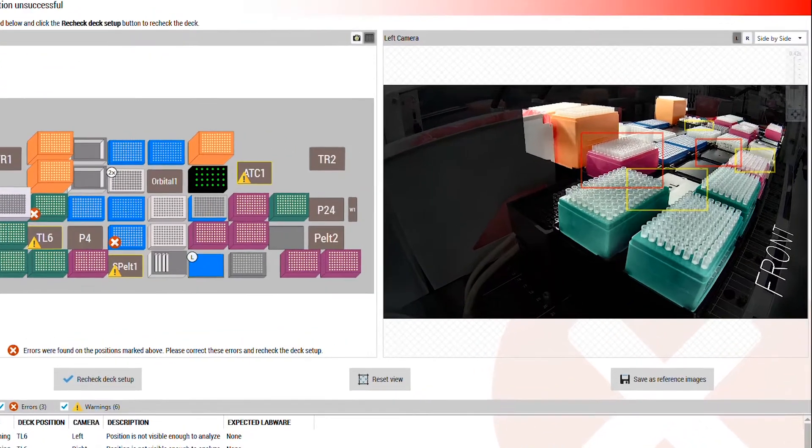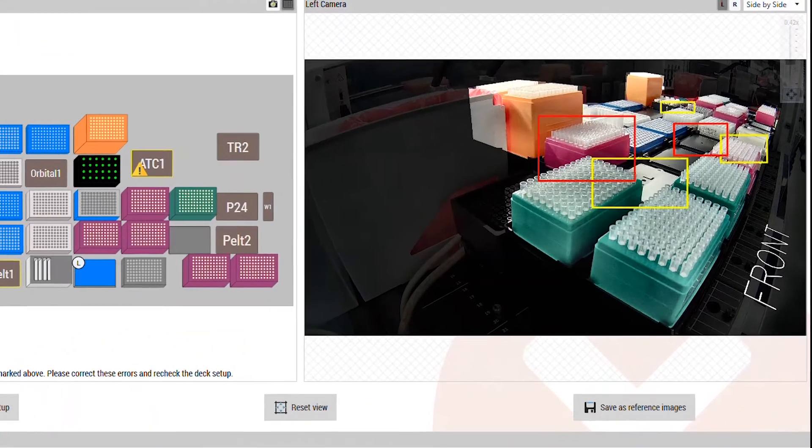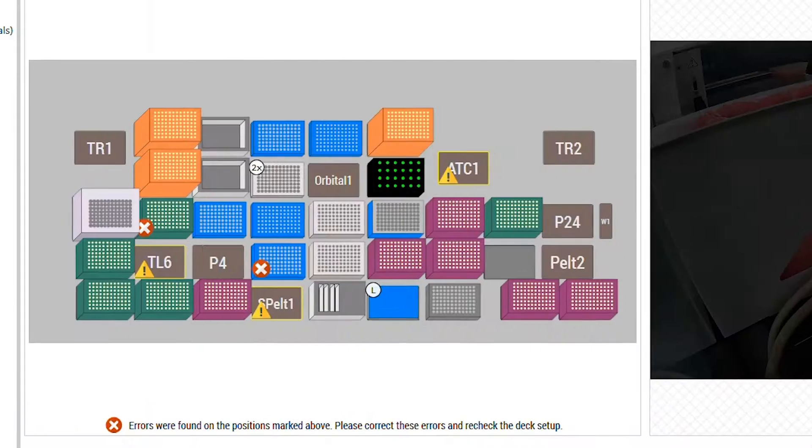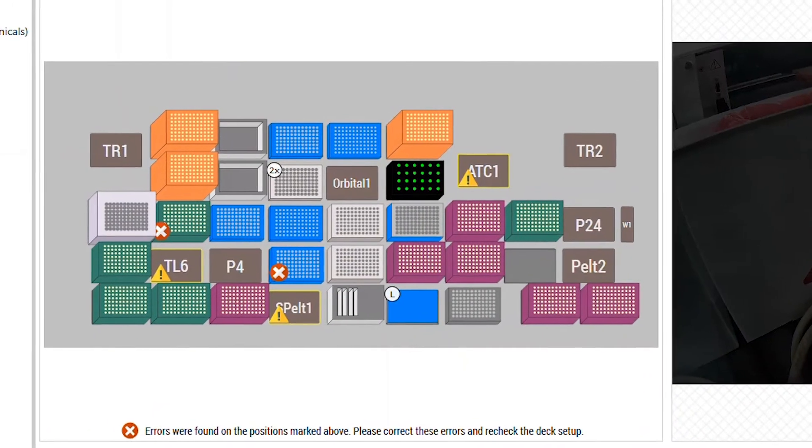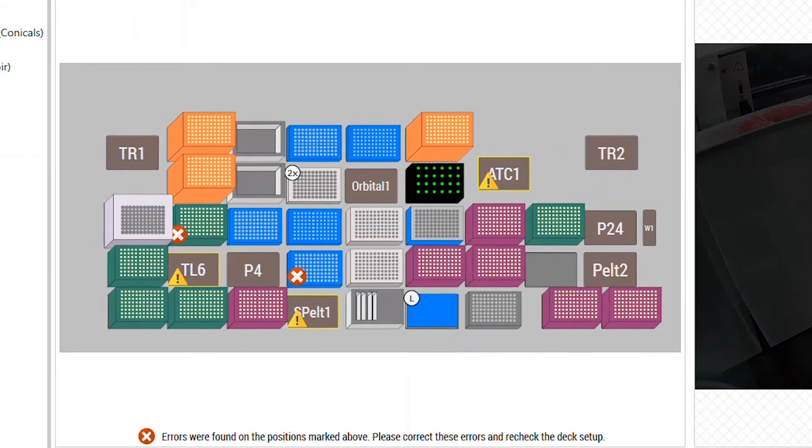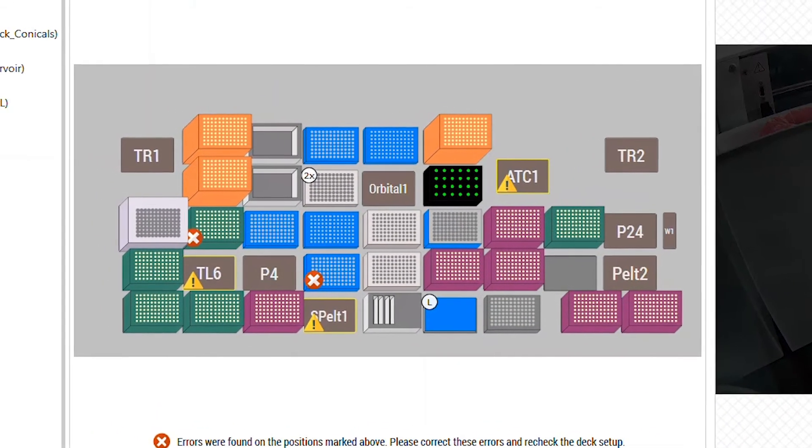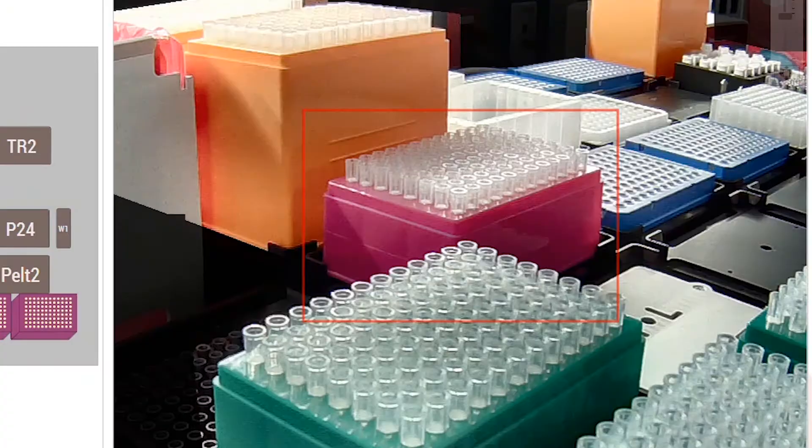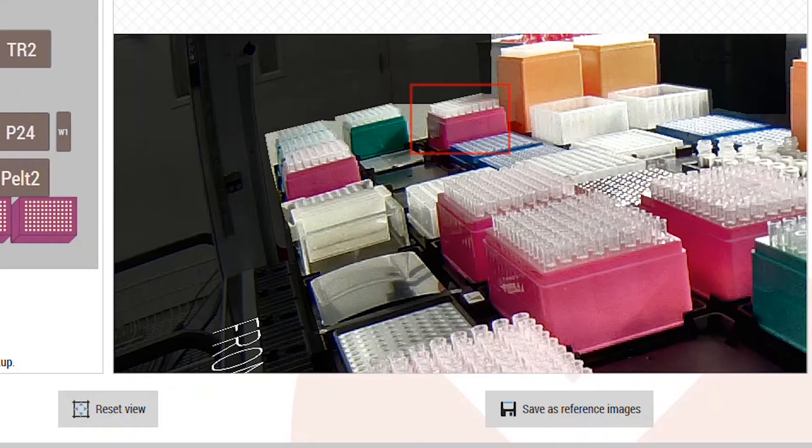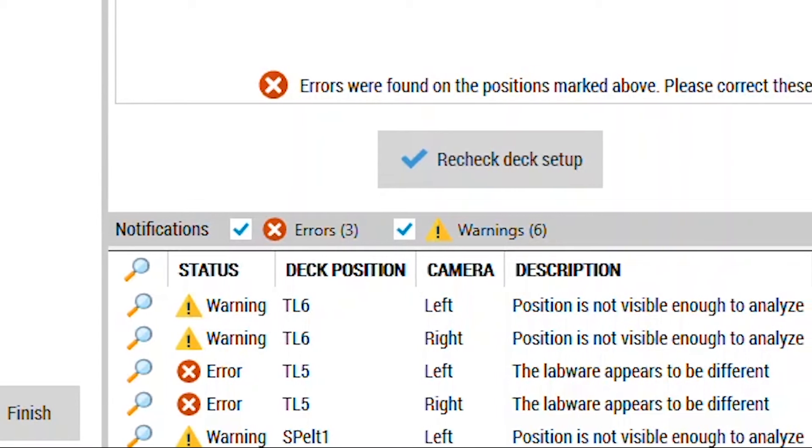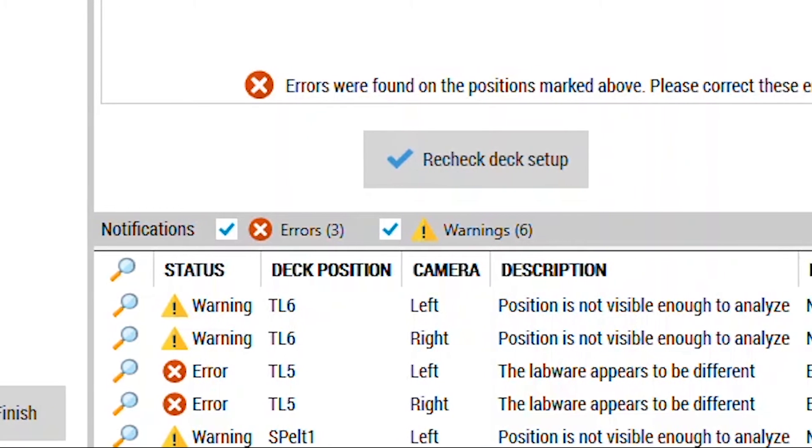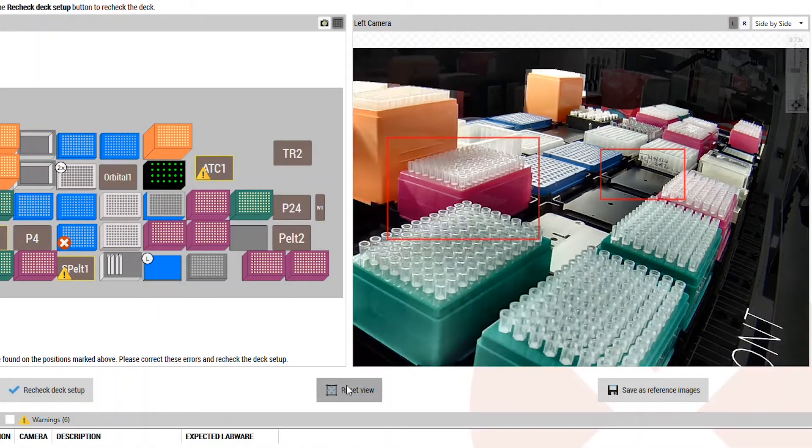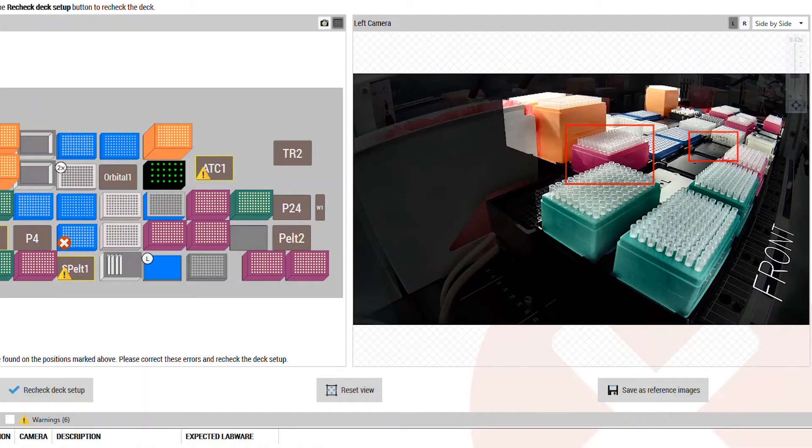If problems are detected, error alerts draw your attention to specific areas on the deck. Common deck setup issues such as missing labware or wrong tip type will be flagged. Final Check has intelligent features such as awareness of blind spots on deck and continues learning to improve accuracy of its analysis over time.